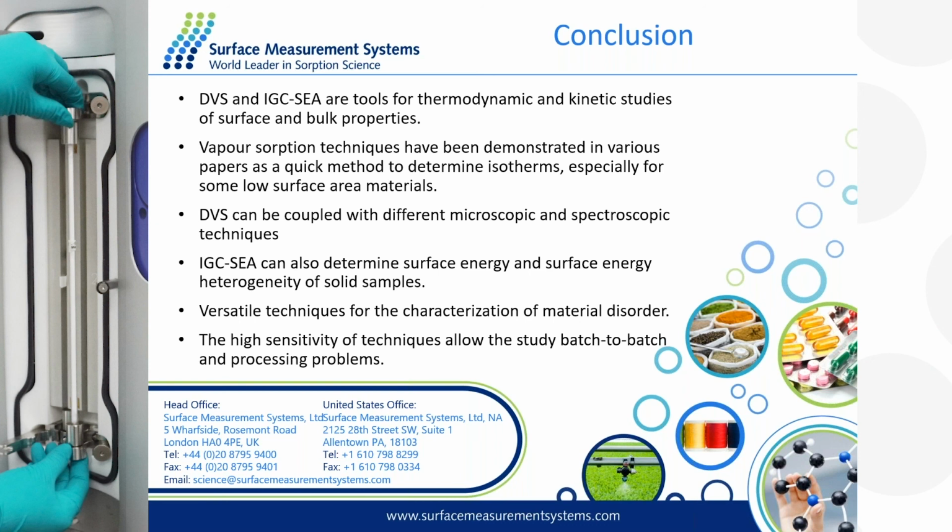I have a couple of questions from the chat. For a particular powder sample, if BET is done on the same instrument installed at two different places under the same conditions, why do the data values differ? If it is the same instrument and the same conditions, the results should be quite similar. The experiment-to-experiment RSD, according to our technical notes, is about 2%, and the instrument-to-instrument RSD is also about 1 to 2%.